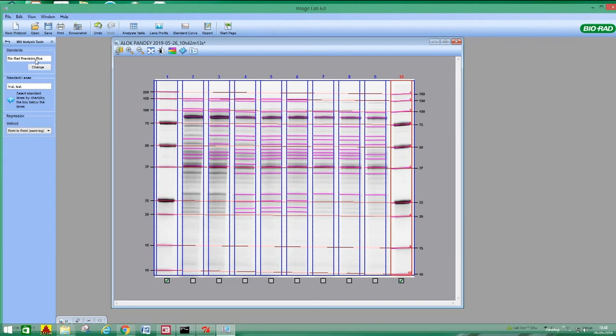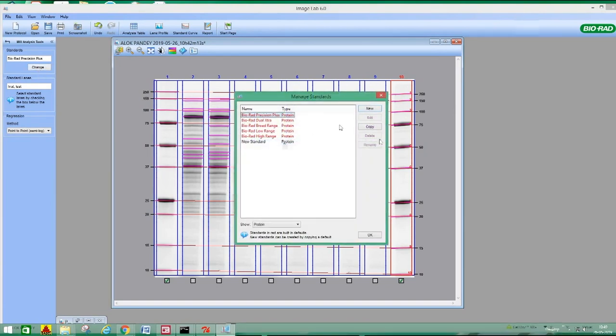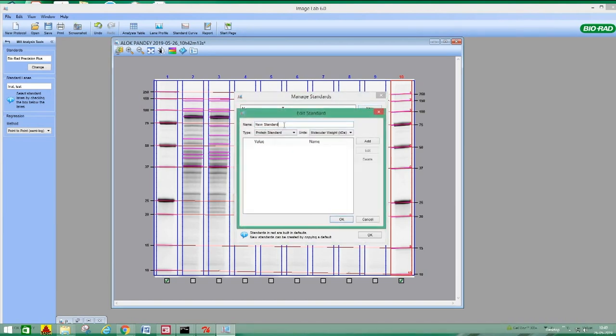Suppose this is randomly taken; by default it has taken Biorad Precision Plus. You can change this pattern also. Suppose you want to add some new protein molecular weight standards, you don't have this Biorad Precision Plus, you have loaded some other thing, but you know the first band appears on top to the lowest bottom band. If you know, you can add a new standard.